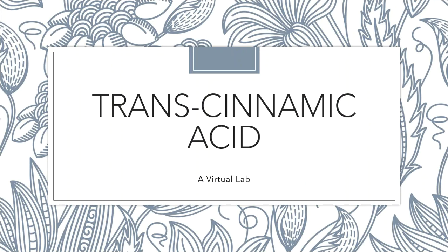And this lab experiment is called trans-cinnamic acid. Well, we're not making trans-cinnamic acid, we're starting with trans-cinnamic acid. And if you've paid attention to the pre-lab videos, you kind of know what's in store. We have a molecule. This molecule has a double bond. This double bond has to be broken. This double bond will be broken by the addition of bromine. One bromine on one carbon, one bromine on another. And it's up to us to figure out how those bromines get attached. Do they go on the same side? Or do they go on different sides?